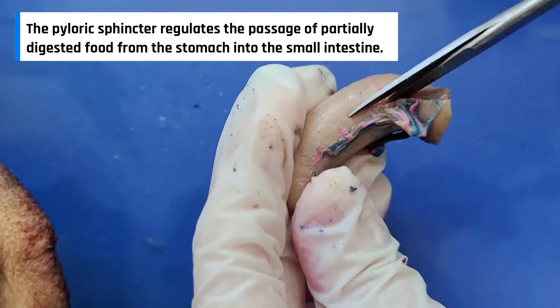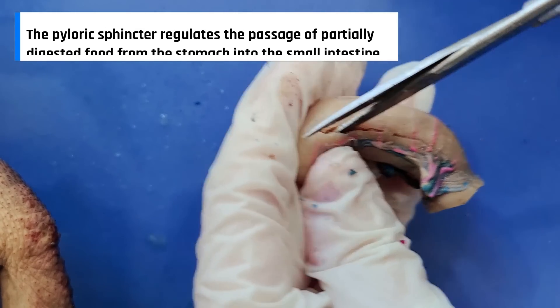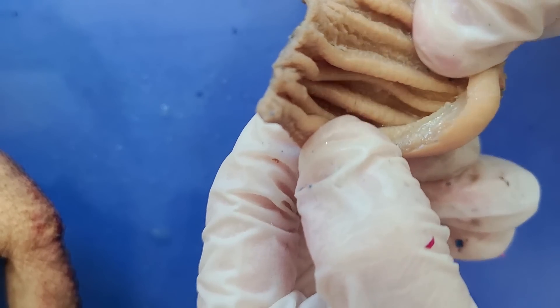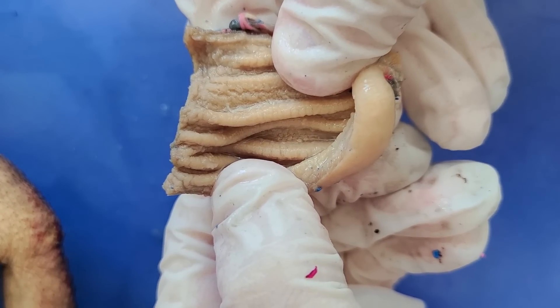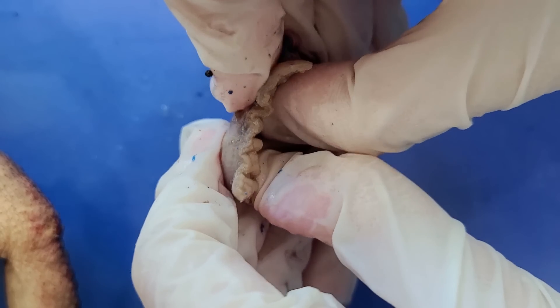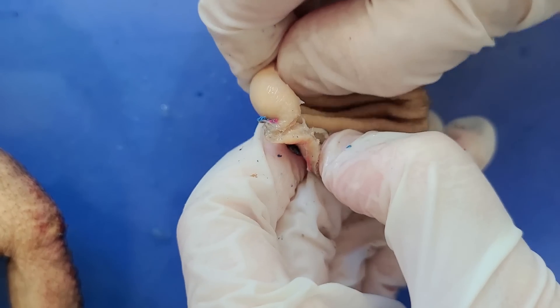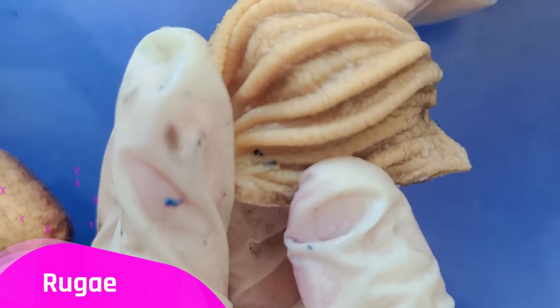Now I'll cut the stomach open lengthwise. The stomach is empty right now, but it has these grooves, as you can see. These grooves are basically like an accordion so it can help the stomach expand. It also helps with mechanical digestion by pummeling the food and helping it break down. These grooves are called rugae.